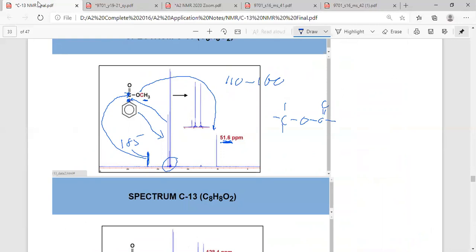Okay, the carbon here. Now these 2 are chemically equivalent. So you take this one here. Wait, let me see. This one should be this one here. I don't know how they do it. The small line sometimes you can't see. So if I put this one here, this one should be this one here, and the next 2 should be the one here. So the furthest away one will be somewhere here. They didn't show it.